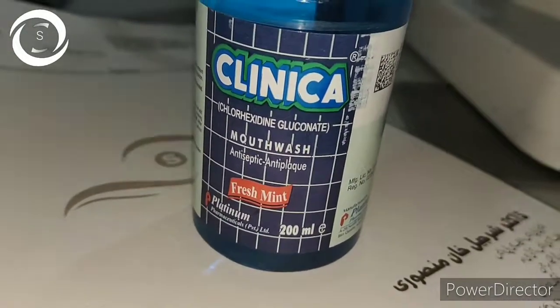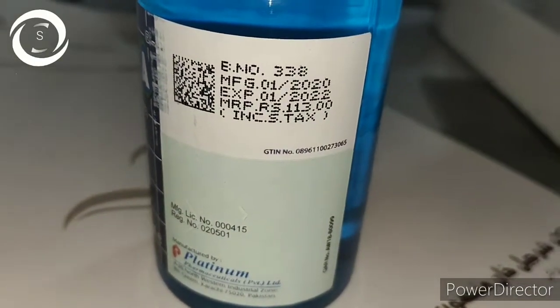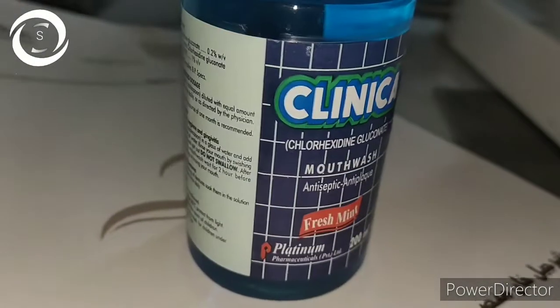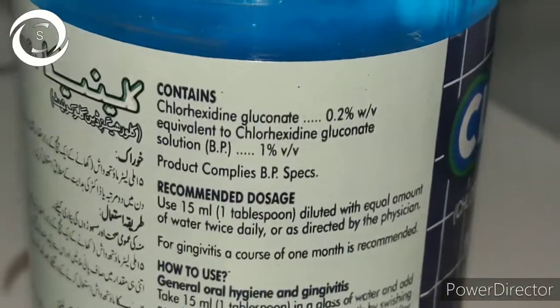I am Dr. Sharjee and today I would like to show you how to prepare 0.02% chlorhexidine eye drops in acanthamoeba keratitis.